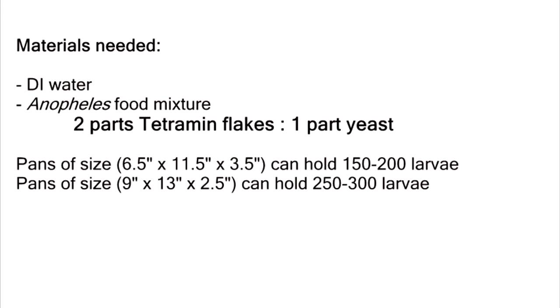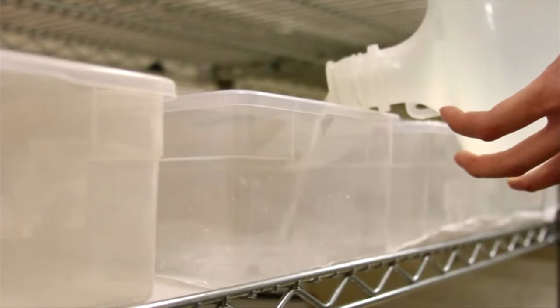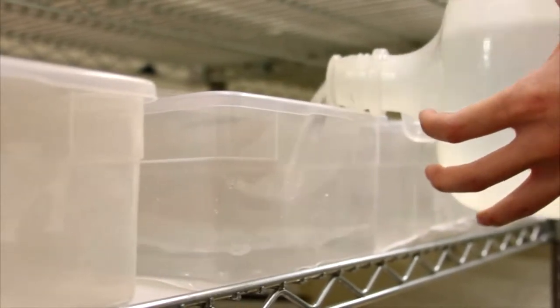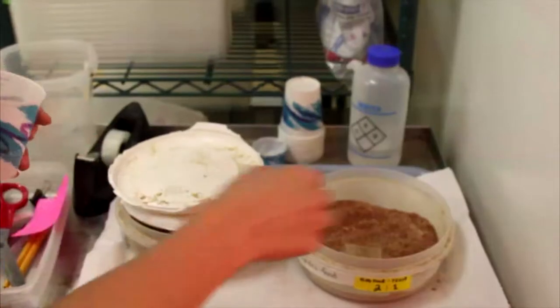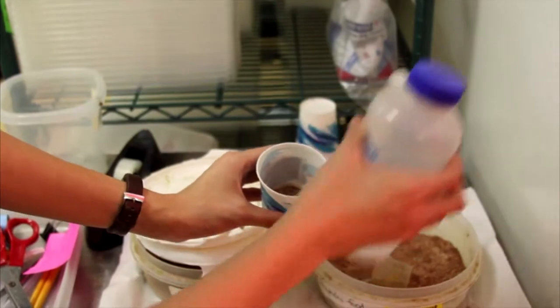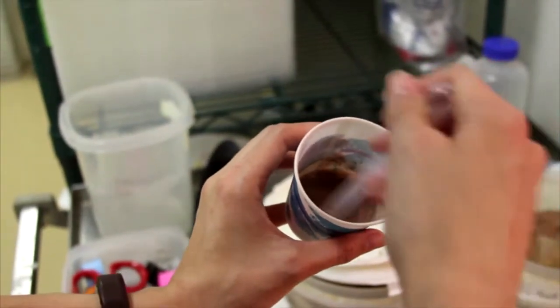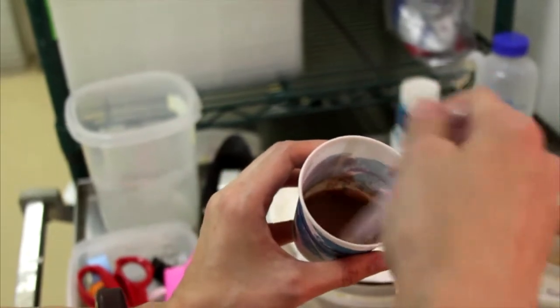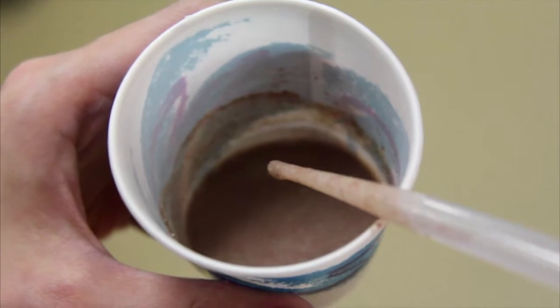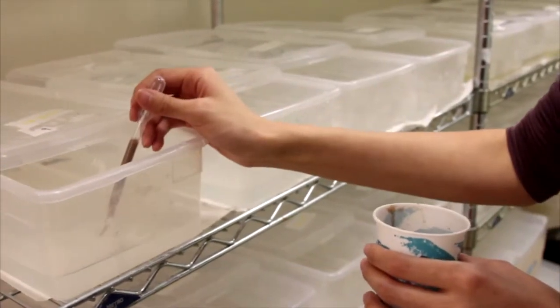Larvae hatch three days after the placement of an egg cup. You'll need DI water and Anopheles larval food. Next, prepare the Anopheles food before adding it to the pan. To make Anopheles food, mix two parts ground tetramin flakes, one part yeast, and add some water to create a slurry. The consistency should be similar to a smoothie. If the slurry is too thick or too watery, it may disperse in the water. Use a pipette to add a dime sized amount of food on the bottom of the pan.